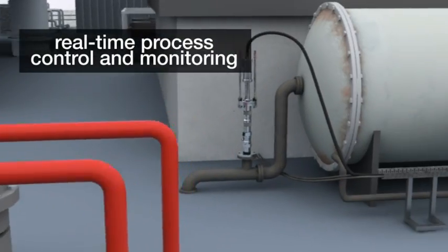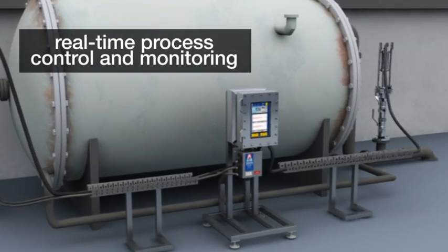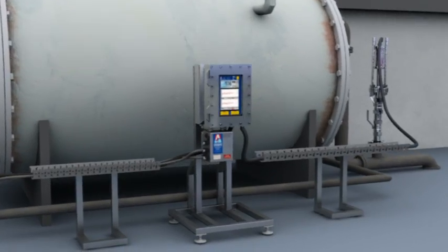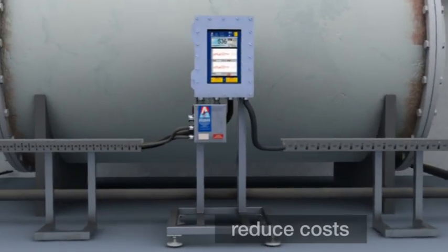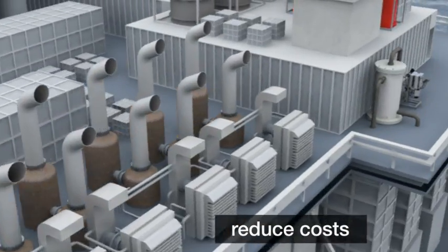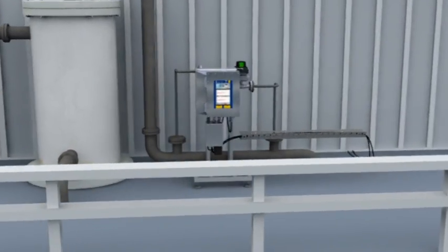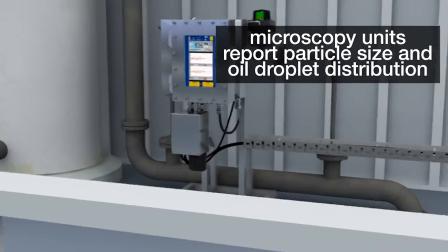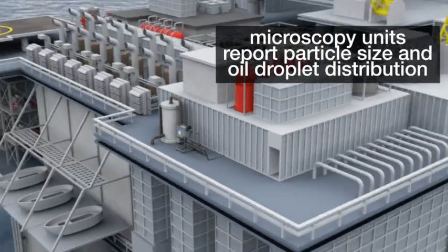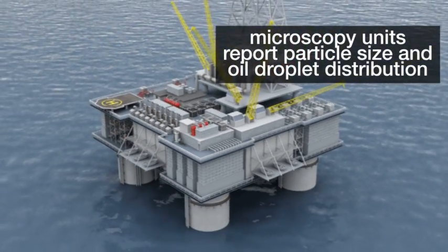Real-time process control and monitoring allows you to optimize processes, report on process issues and reduce costs. Oil concentration is not the only concern. Our microscopy units report particle size and oil droplet distribution.